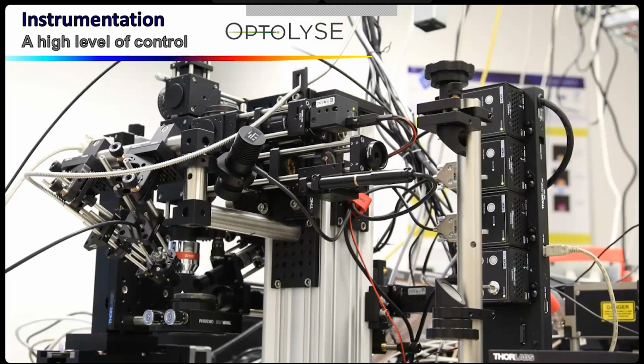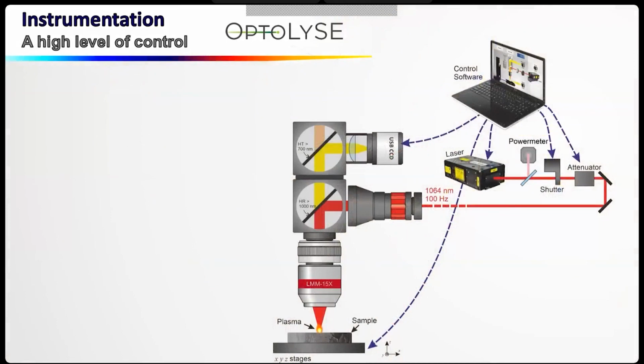We are using a reflective objective because this instrument is also coupled to a Raman system, so like this we don't have any chromatic aberration. Here you have 2 collection lines, so 2 spectrometers connected with optical fibers, some pointer lasers, and so on. In fact, we also work a lot on the protocol, the data processing software, and the control software of the equipment.